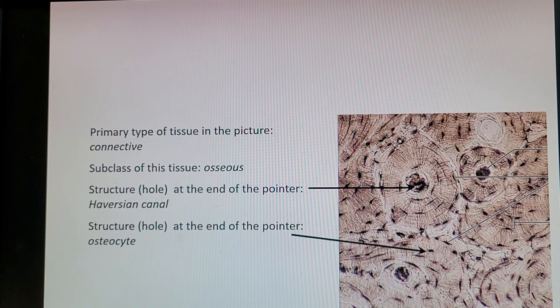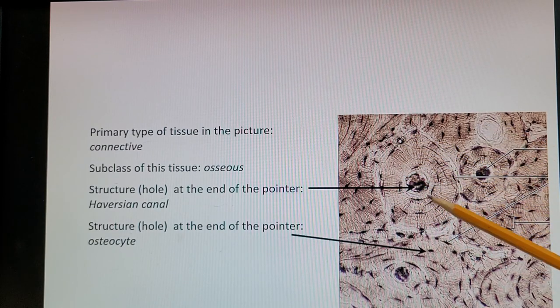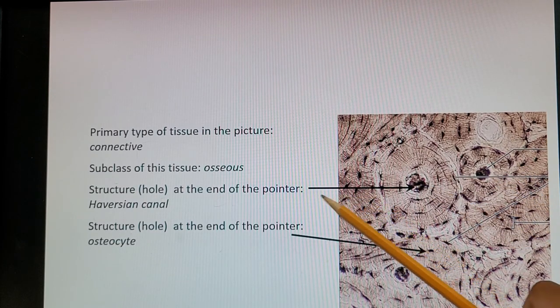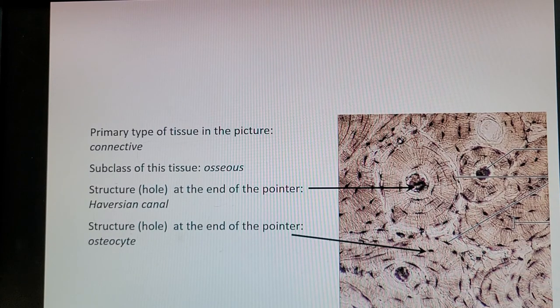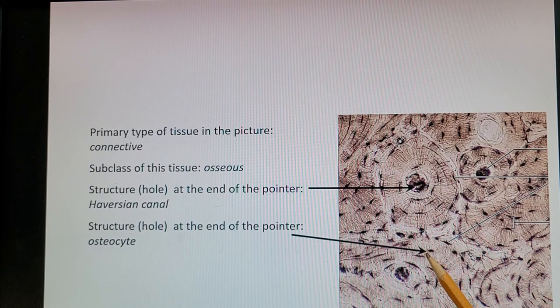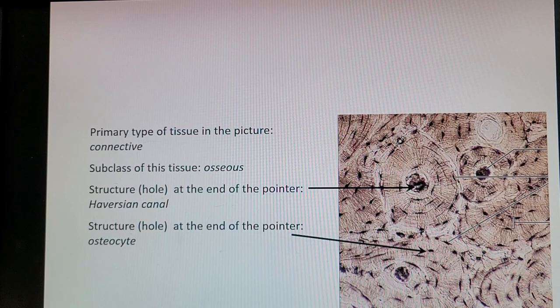The last picture is yet another connective type — osseous tissue, or bone; specifically compact bone. Osteons make up the picture as large circular structures. The dark circles in the middle are the Haversian canal (also called the central canal), which allows passage of nerves and blood vessels through the length of bone. The other structure is an osteocyte in a lacunae — osteoblasts build bone until they become trapped, becoming osteocytes, with canaliculi extensions that look like little spiders, allowing communication to other cells.